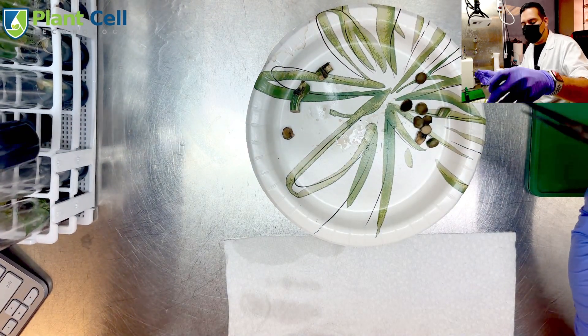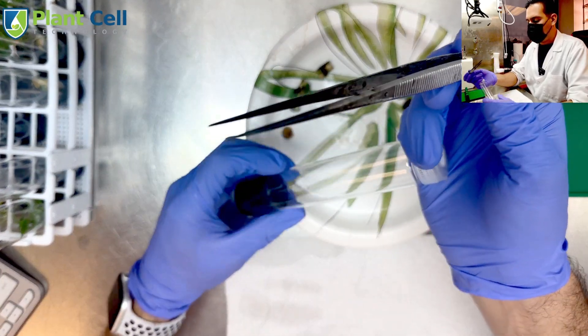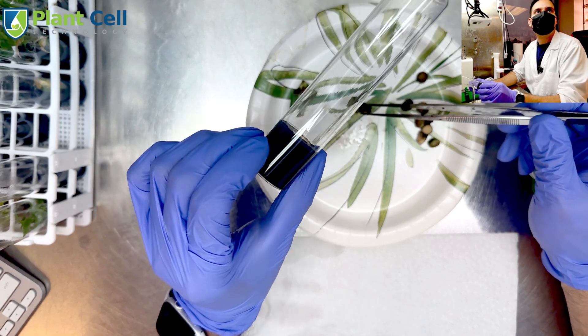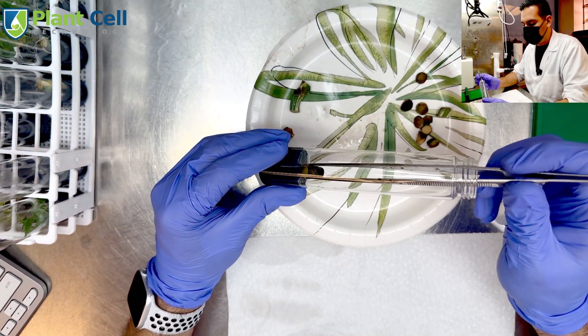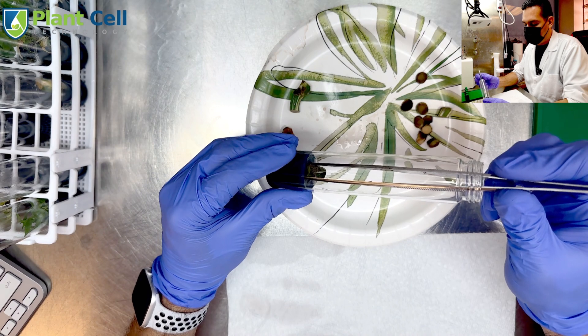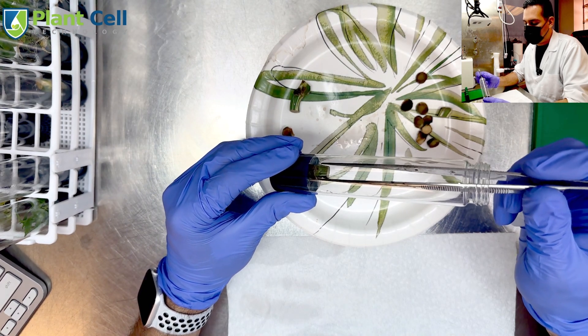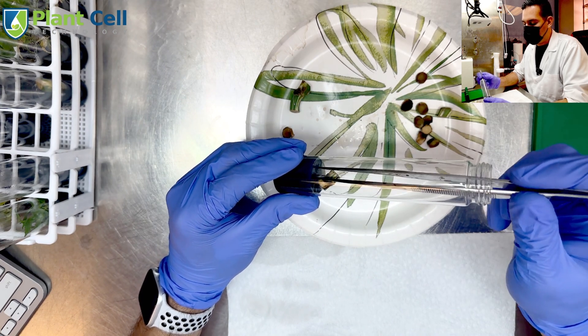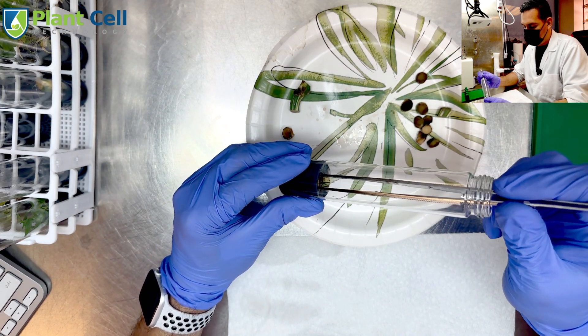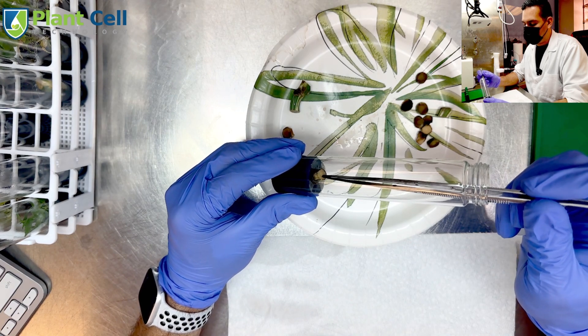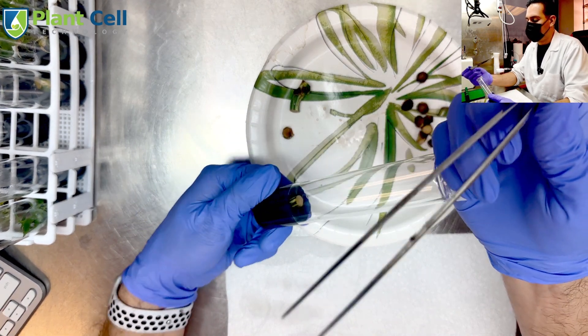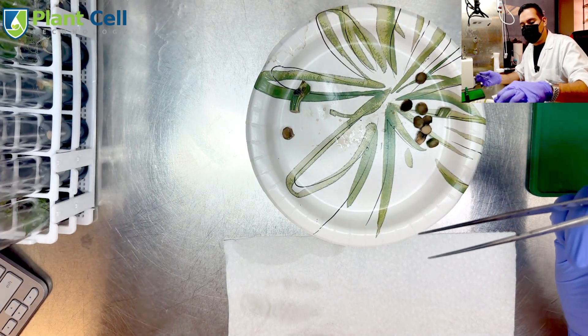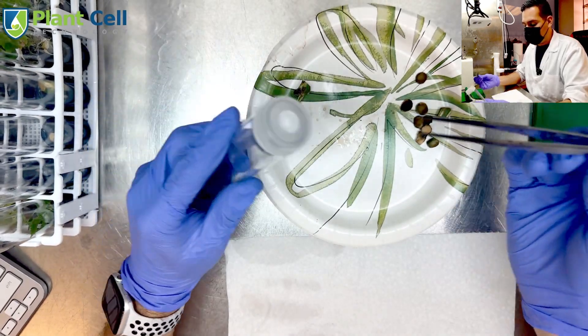I like to use test tubes instead of larger containers because test tubes use very little media, between 15 to 20 milliliters, and if the plants get contaminated then I don't waste as much media. That's why I always recommend beginners, or actually everybody, when starting cultures to start them in something small like a test tube or petri dish.